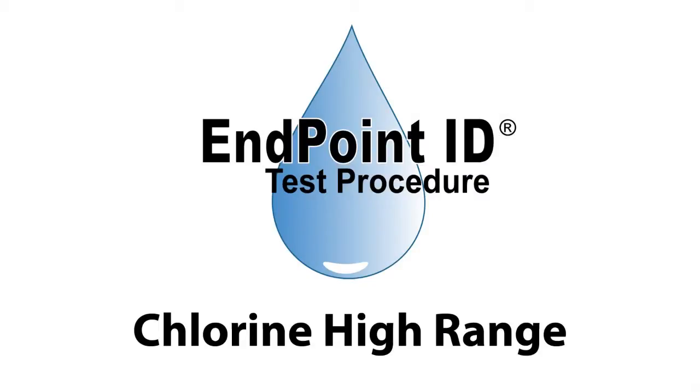This is a demonstration of a high-range chlorine drop count test kit using Endpoint ID procedures.